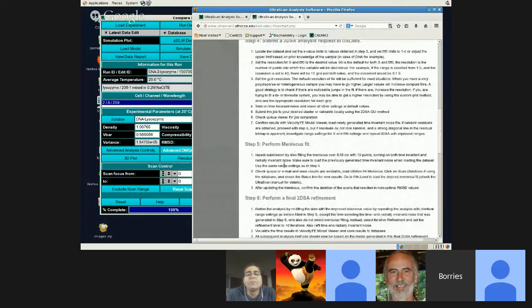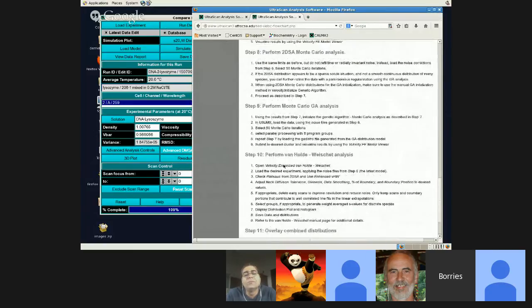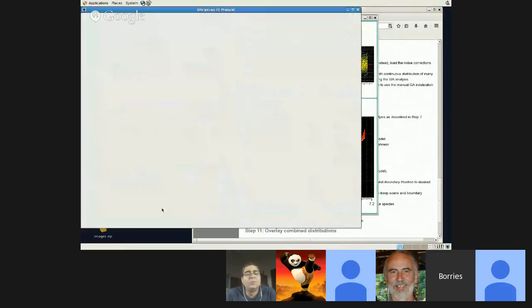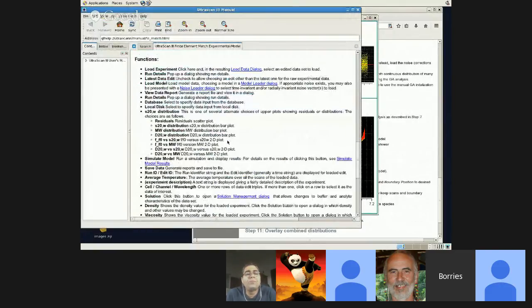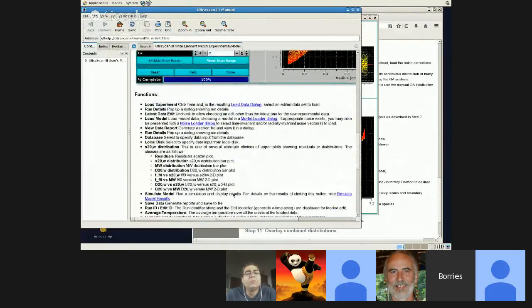You might want to read that too as a guide to help you through the refinement process to get to the final answer. And also in each program there's extensive help, so you'll always find a help button in there. If you click on this, it'll load up the help documentation, and it'll document a lot of the things that I've been talking about. And if there's anything missing, let us know, and we'll be happy to help you out again. So please make use of that.